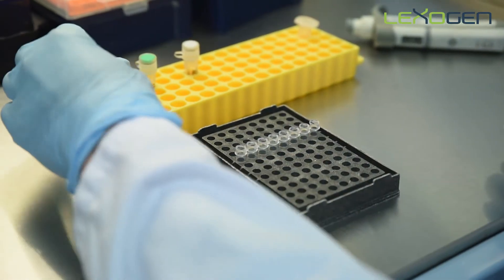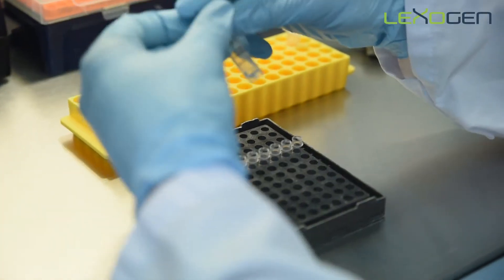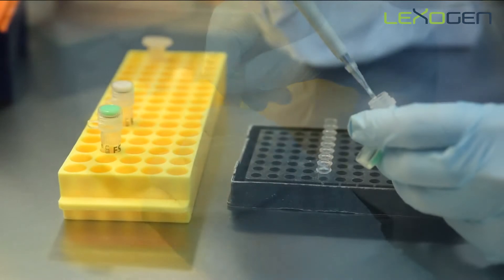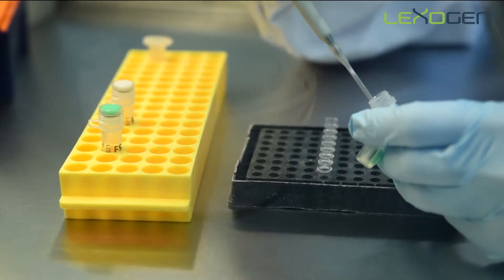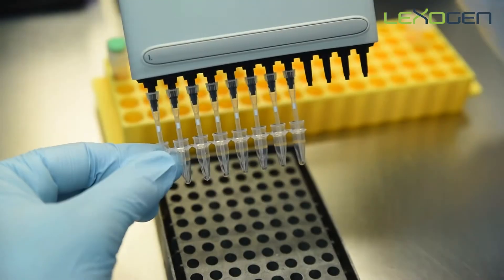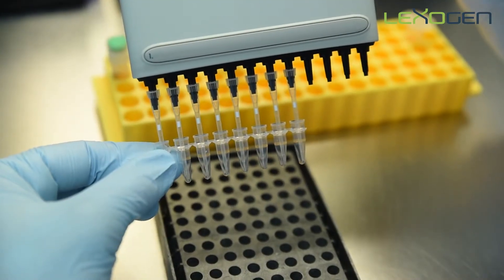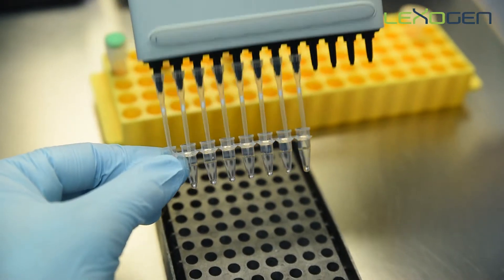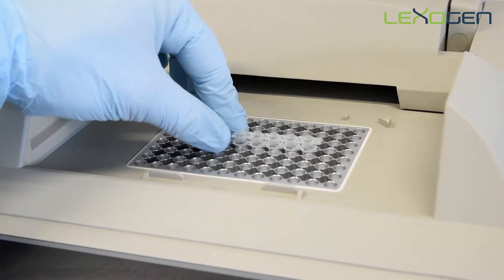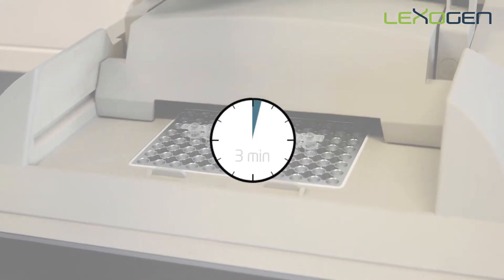Prepare your RNA in a volume of 5 microliters. Add the FS1 buffer to the RNA and mix well by pipetting. Spin down the samples briefly and place the samples in the thermocycler to denature at 85 degrees for 3 minutes, then cool to 42 degrees.